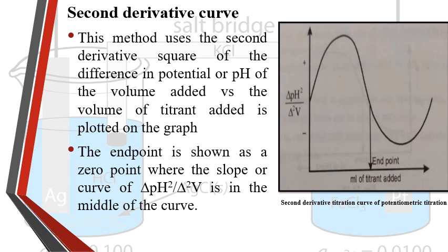the titration curve. Start with the basic potentiometric titration curve, where the electrode potential E is plotted against the volume of the titrant added. When you compute the first derivative of this curve, you identify the inflection point where the potential changes most rapidly.